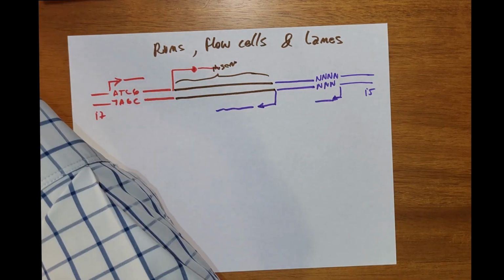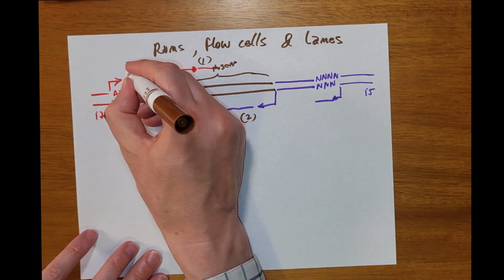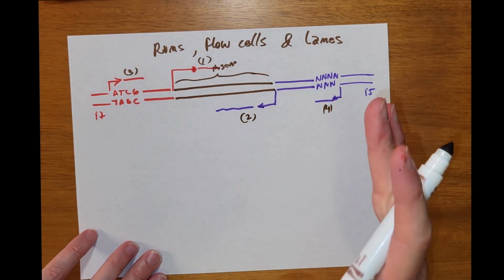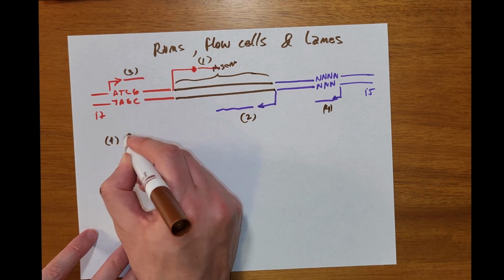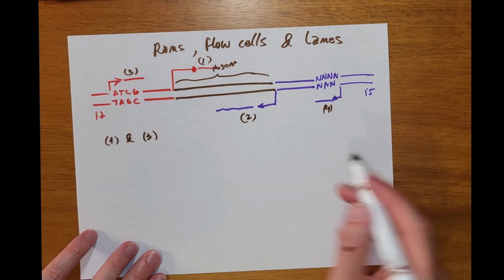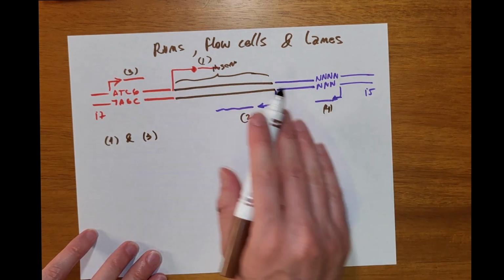So if we label the runs like 1, 2, 3, and 4, you can have different combinations. For example, if you didn't put any UMI and you have barcoded samples of a short read, you can use read 1 and the barcode sample, and so you need this read here, and you can use any combination, and you can put one or not put the other.